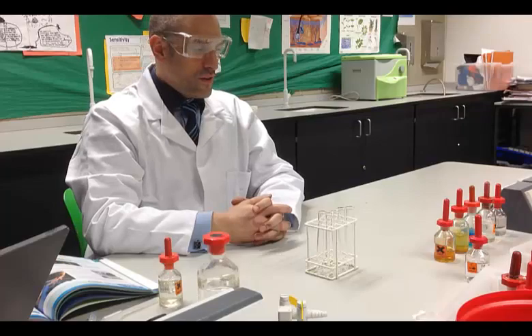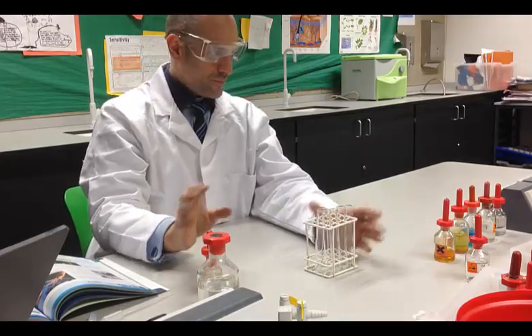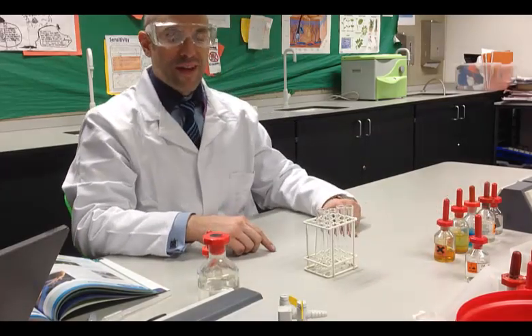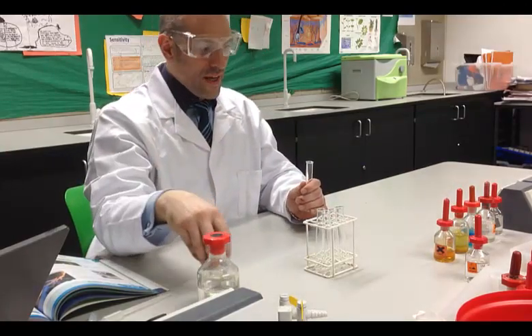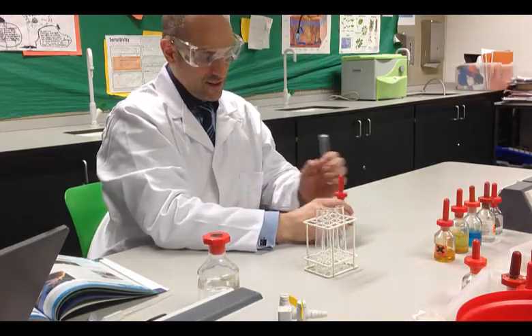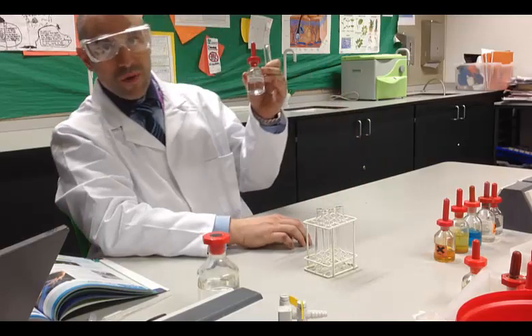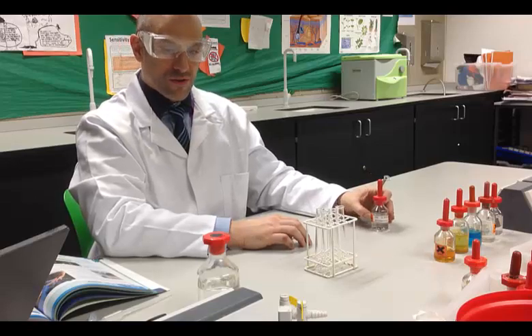Okay, the sodium hydroxide test for metal cations. I'm going to test aluminium, calcium, copper 2, iron 2, and iron 3. The test reagent will be sodium hydroxide, hence the name of the test, which is nasty stuff. It's corrosive, gets in your eyes, you'll be in trouble. This is only 1 molar sodium hydroxide you're using, so not that dangerous, but still one must wear goggles.